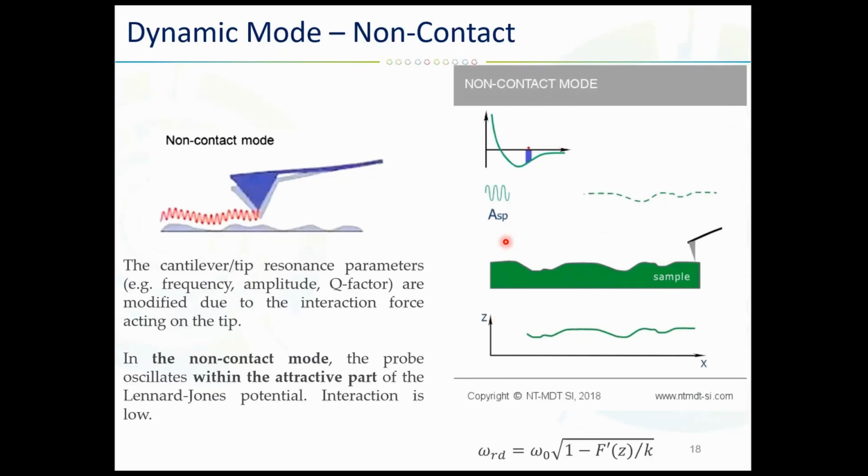The advantage of the non-contact mode is that the tip never contacts the sample, so it will not destroy it. So it's quite important for biological applications.